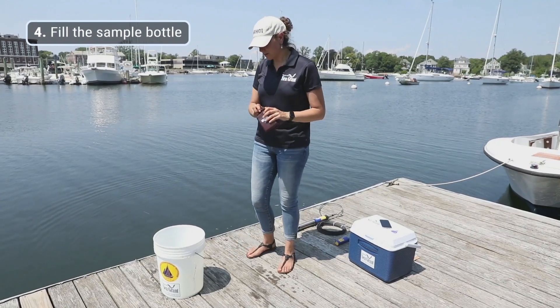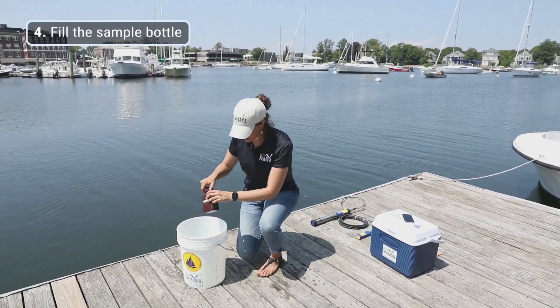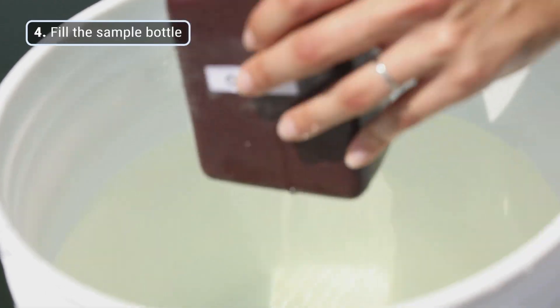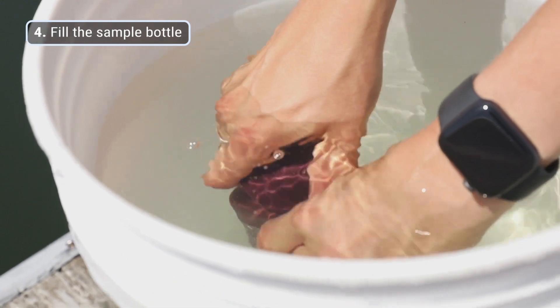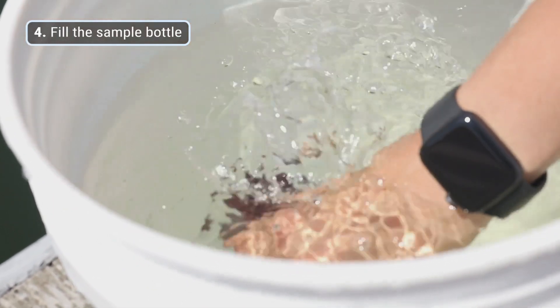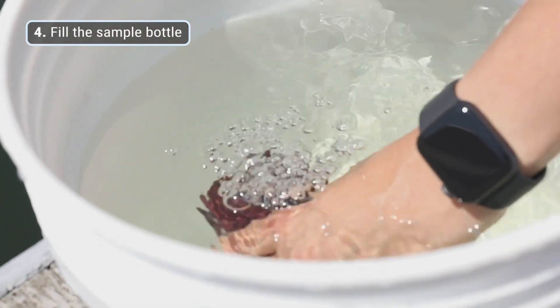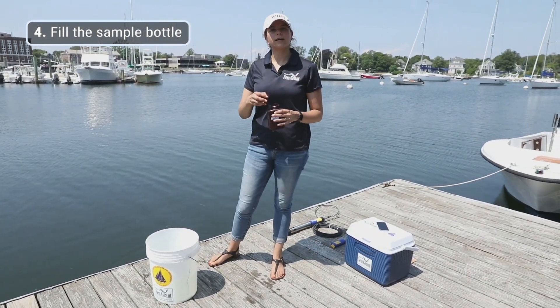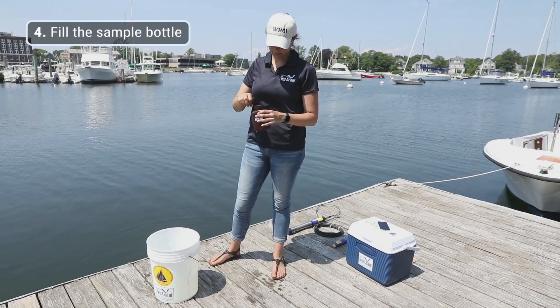Now we're going to fill the bottle for our water sample for total alkalinity. It's going to be the same as rinsing — leave the cap on, put the bottle into the bucket, open the cap, let the bottle fill, and dump a small amount of water out to allow for headspace for thermal expansion of your sample.